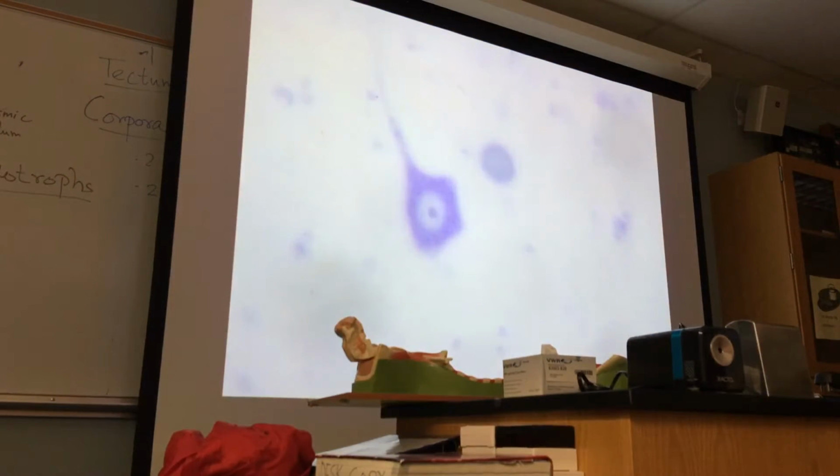It's remarkable. Look at that. This is a whole cell body, isn't it? But you see these granular structures, positively stained regions. They represent the Nissl bodies. So anywhere, if I point and say identify the organelles, your answer should be Nissl bodies, okay? Though they are rough endoplasmic reticulum, I want you to learn this as Nissl bodies.